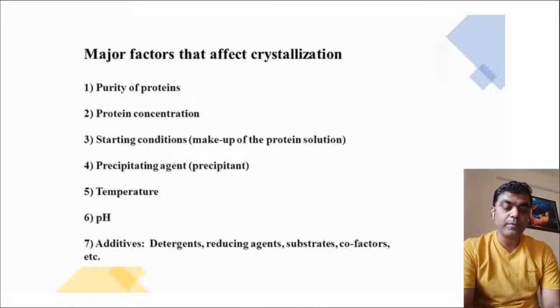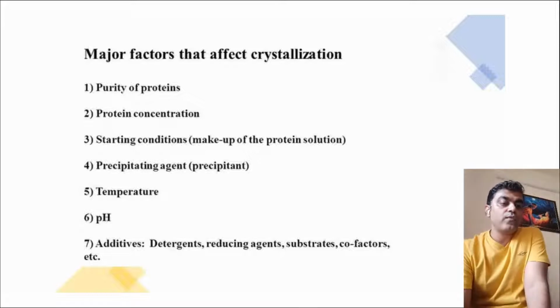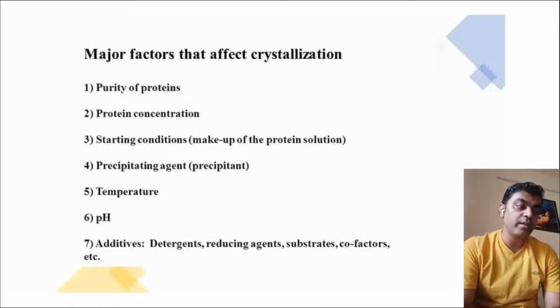Obviously temperature is very crucial, because the temperature will assure the slow and steady evaporation of the solvent, leading to the formation of nucleation and then further to the crystallization process. Suppose I have started at 4 degrees today, and tomorrow all of a sudden it is changed to 24 degrees, and then again temperature fluctuations have happened. So this will lead to non-uniform evaporation, and the crystal structure will be affected. So temperature is a very important criterion here.